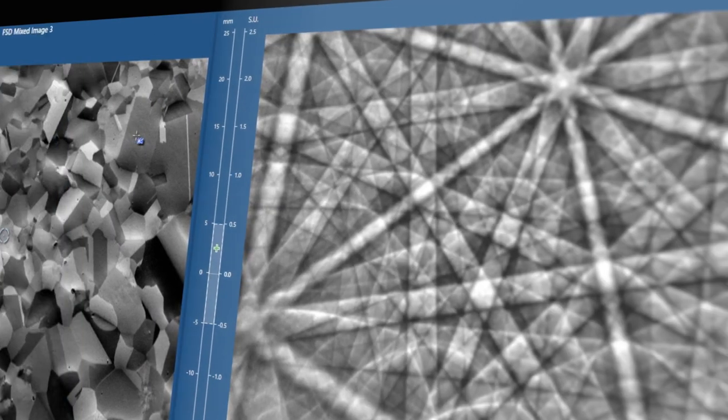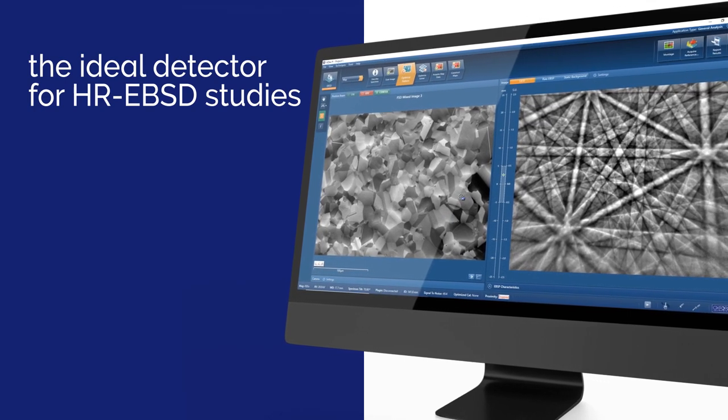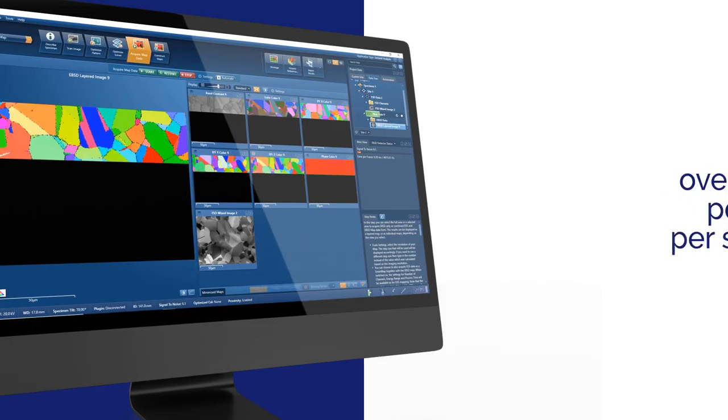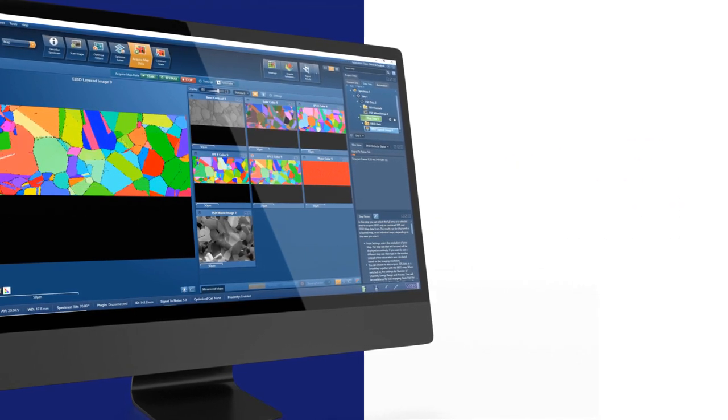Symmetry S3 collects megapixel diffraction patterns, making it the ideal detector for high angular resolution HR EBSD studies. The S3 detector also delivers extreme speed, with analysis rates exceeding 5,700 patterns per second. This enables standard grain size measurements in under 60 seconds.